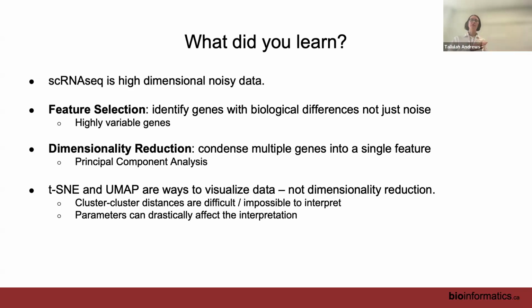So when you run diffusion maps, you specify how many dimensions you want, and it will generate the best however many dimensions you ask for.